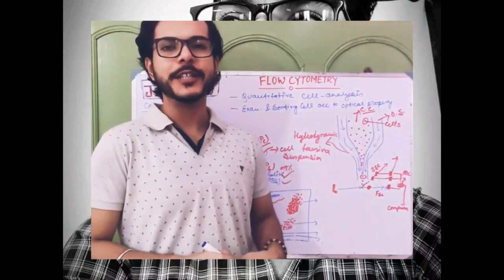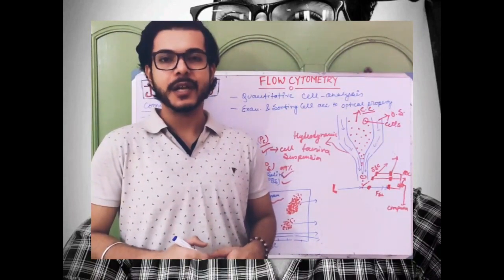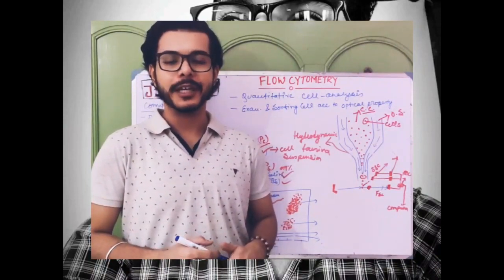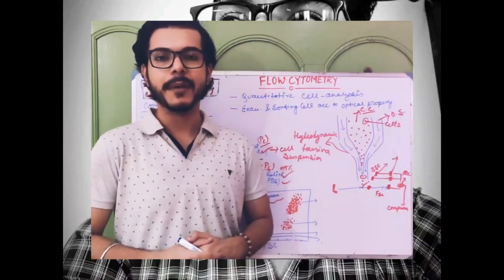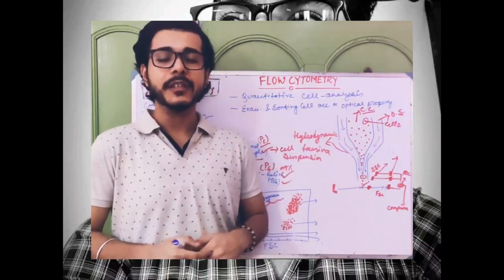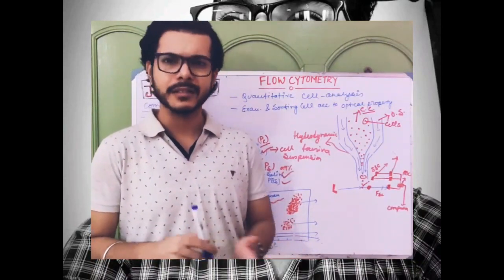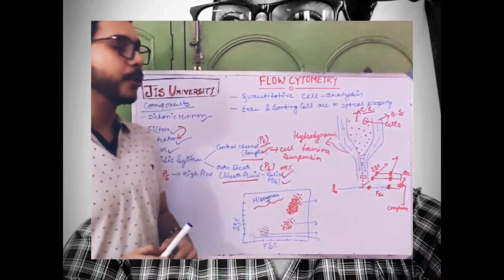Hello everyone, welcoming all of you to Pharmacy Guide. Myself Sakshar Shah, I'm an assistant professor from the Department of Pharmaceutical Technology, JIS University, welcoming all of you in today's video lecture. In these days we have been talking about cell culture and different aspects of cell culture, and today the topic I'm going to discuss is very important in case of cell culture, and not only cell culture, in a separate way as well. So the topic is flow cytometry.